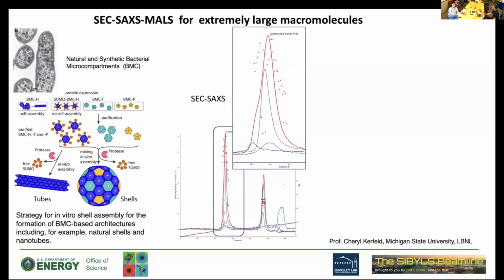And so we can see different samples at different elution times, or some in vivo expression of these BMCs have some very broad peak with some shoulders and tails. So this is just zooming in at the main elution, where here you have the single components, the non-complex state here at the end. So that's the beauty of this new technology with the new columns.